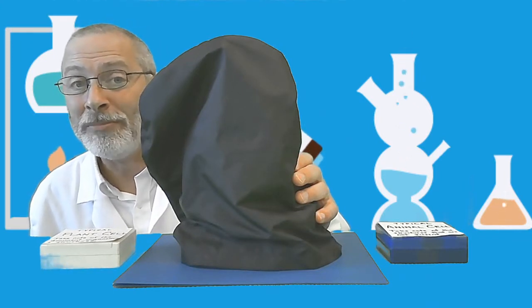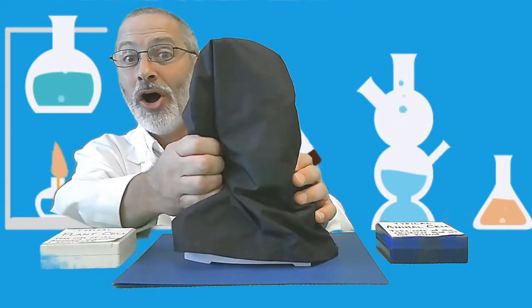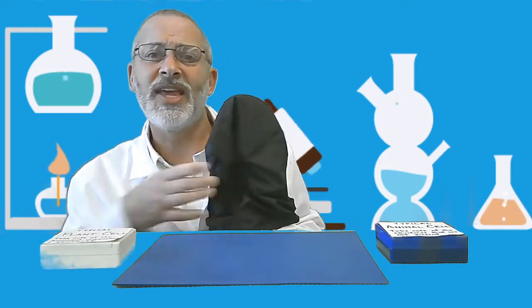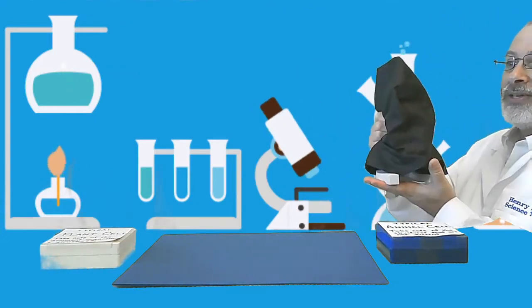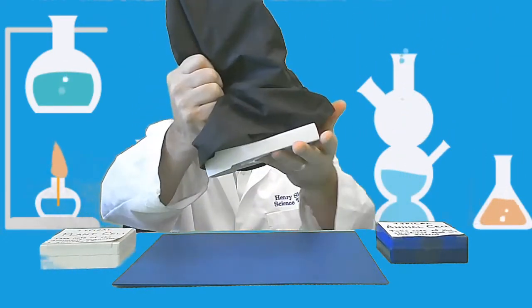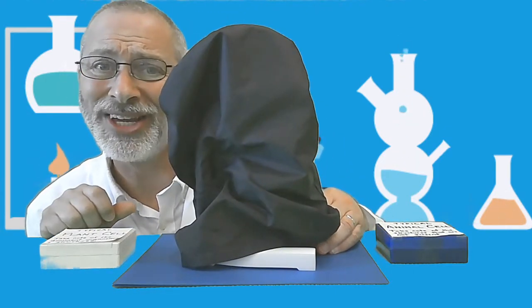I hope you remember the ABCs. The arm, the base, and carry it close. Everybody, the arm, the base, and carry it close. That's right. It's a catchy little rap, don't you think?